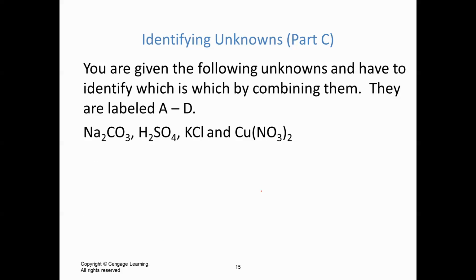All right, on to part C. Now part C is the most challenging part of the lab. You'll be given a series of unknowns, and you're going to have to combine them together in order to figure out which one's which. And you may also actually have to expand and combine them with stuff from part A or part B. If you want to do those other combinations, then just ask the instructor, and the instructor will give you clearance about whether or not it's safe and how to handle the waste and stuff. But if you're lucky, you might be able to figure them all out based upon just mixing them with each other. So for this particular example, it's a little bit smaller than the one you'll be doing in lab.